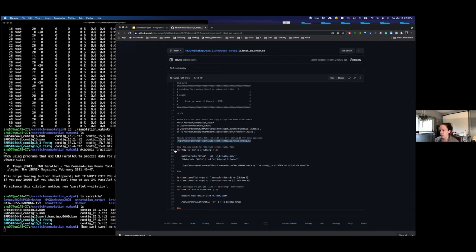Okay, so the next thing it does is a loop. So here's our loop. That whole thing's a loop. In this case, it wasn't really necessary because we only have 2 files. But if you're not familiar with this stuff, this might be useful for real data. We wrote it in a loop because most of the time you have a ton of RNA-seq data that needs to be processed at once. So this will go into a directory, look for all the FASTQ files that it finds there, and then map them. And in this case, we have paired end data, so it goes in and finds the mate 2 for that FASTQ file.